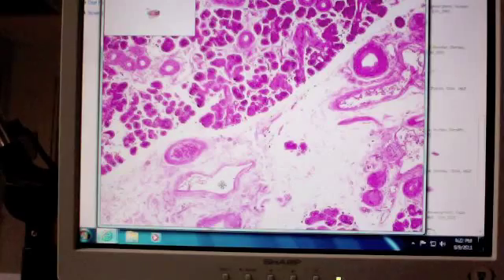How can you differentiate between the mucus gland and the acini? So if I asked you to name this gland, I would be looking for mucus gland. Okay. Name this structure and then no pointers anywhere. All right. So I'm asking you for everything that's on that surface. If you wanted to say to me multiple secretory units of a mucus gland, you could say that. All right. But only one of those structures is a secretory acinus.